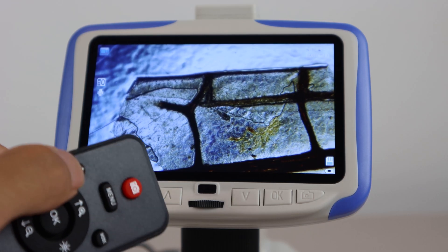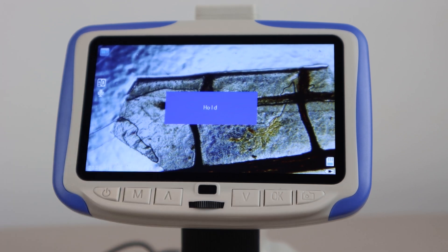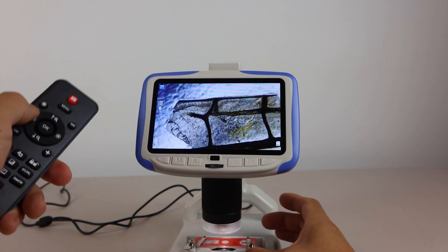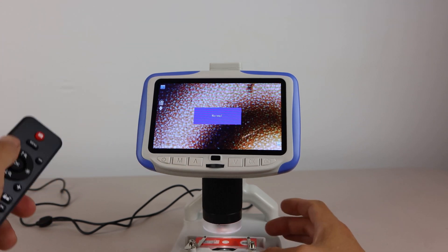When viewing a sample, if you hit the freeze button on the remote, then the image on the screen will not change, even if you move the sample around, unless you unfreeze the camera feed.